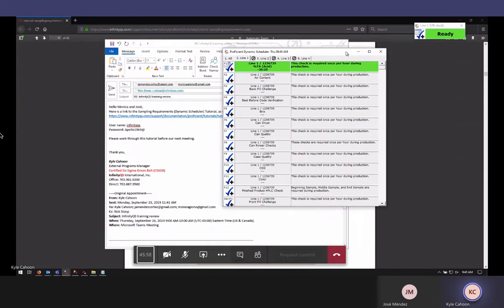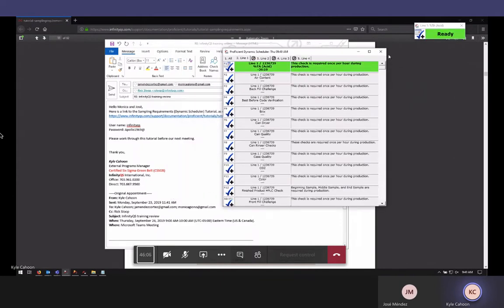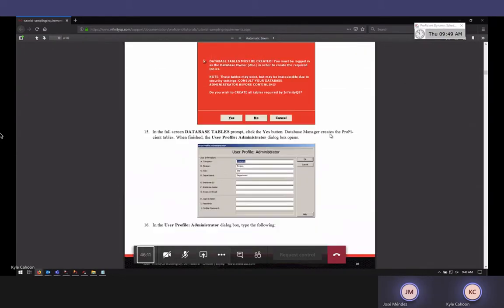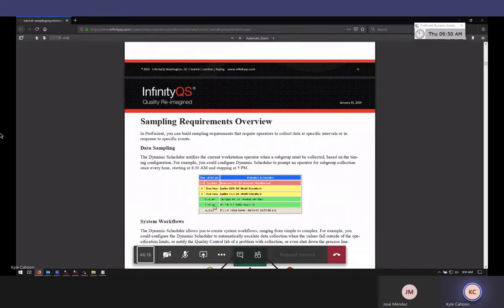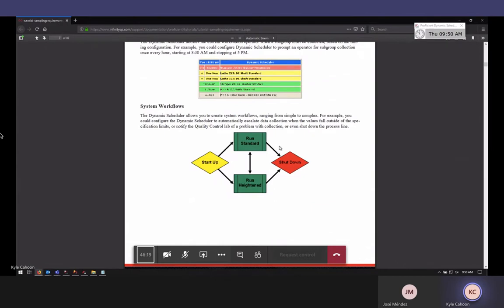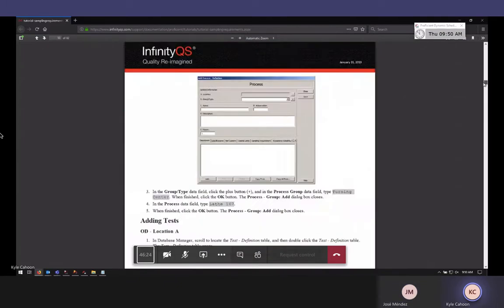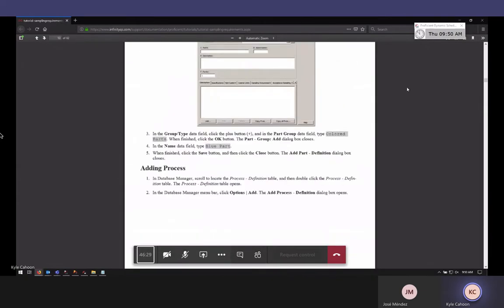So there's quite a few pieces of this, so I don't expect you to fully understand it immediately. But the tutorial does do a good job of, again, starting with the explanation of what the system does and how it works. And so let's focus on this for the next meeting, and then we should be very close to finishing up the training after this.